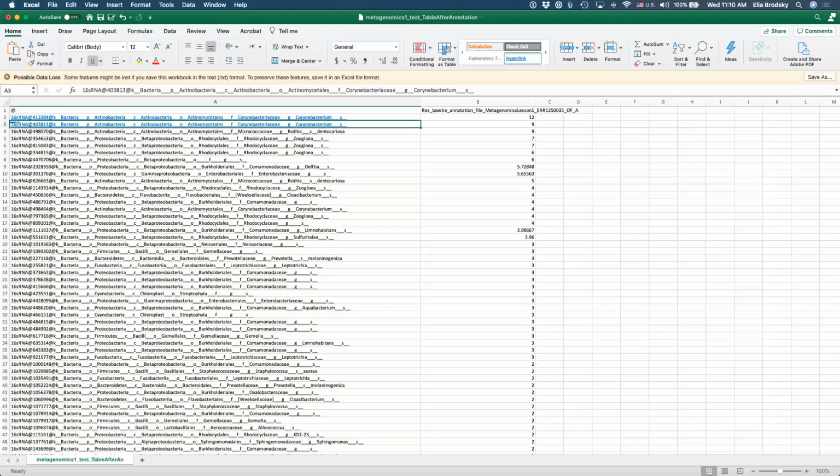All right, great. So there you go. There's histamine receptor. Okay, I'm not sure that's that, because it's actually the 16S ribosomal RNA gene, right? So I'll look for it later and I'll kind of update. But the idea is that you have an ID. This is an ID from the Silva database, and that is annotated by different levels of taxonomy. And based on what level of taxonomy you want to use for your composition, that is the information that you can get out of this table.